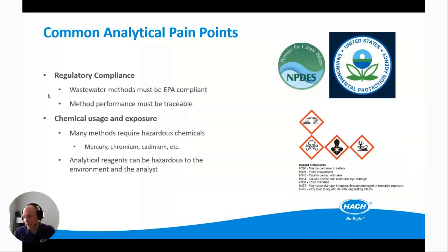In addition to that, there are chemical usage and exposure risks and pain points. Many of these methods require hazardous chemicals. I mentioned earlier the Nessler reagent contains mercury.